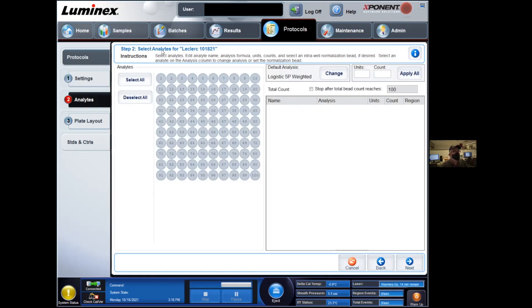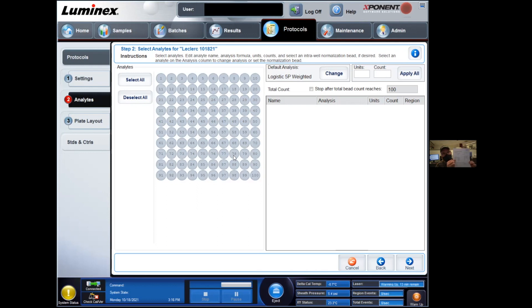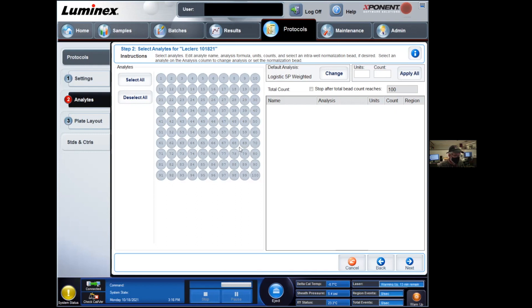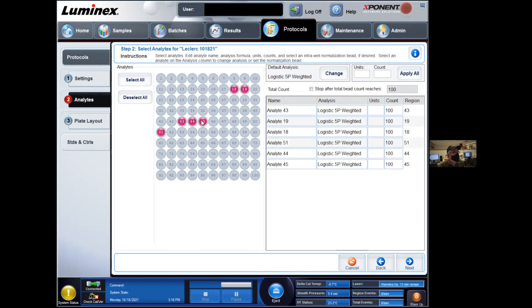The next step is entering the information about the analytes we're going to be looking at. So the grid here represents the different beads, a combination of dyes that can stain those beads. There's a hundred different combinations and each of these beads will represent the specific analytes that you're going to be looking for in your experiment. Now your certificate of analytes has the list of analytes that you're looking for. And in parentheses, you should have the bead number. And so you simply enter these numbers in. So in this case, we have a bead 43, 19, 18, as well as 51, 44, and 45.